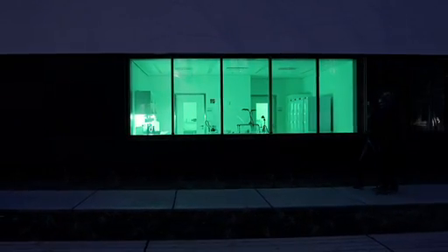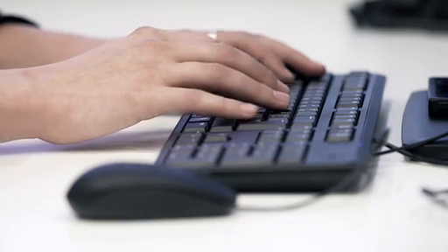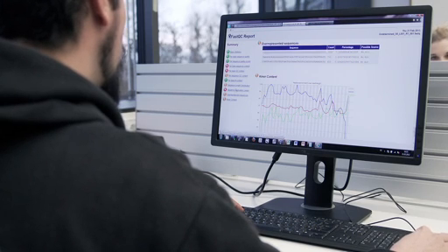The work goes on even after the researchers leave for the night, as computer programs continue to analyze the sequence data. We use highly parallel DNA sequencing methods to read the code of the ancient DNA. After the DNA sequencing is complete, the computational work begins, and it lasts at least as long as the laboratory work.